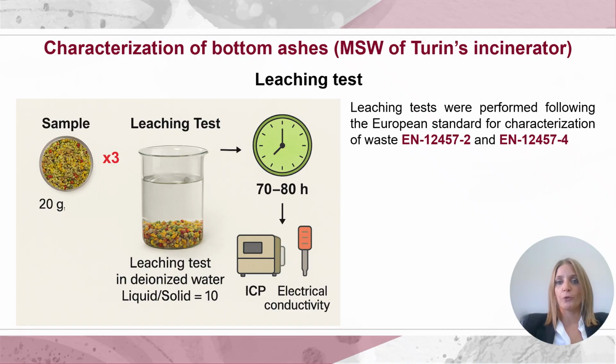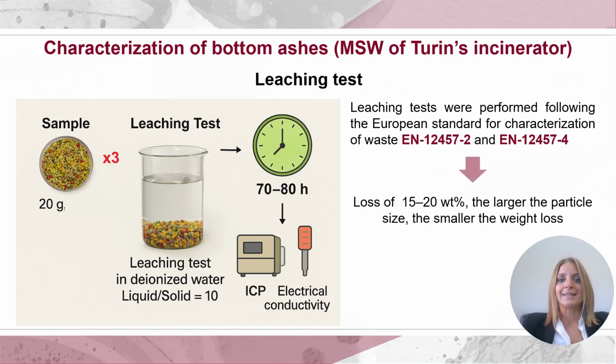Leaching tests were performed according to the European standards with a liquid-solid ratio of 10, and the samples lost about 15–20% of their mass, especially in the finer fraction, confirming, unfortunately, that the amorphous phase is for sure the most reactive.